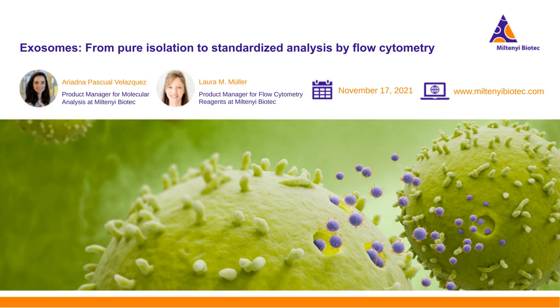What is the size range for the magnetic isolation beads? And the graphic shows them as small compared to EVs. Is this really true with respect to exosomes? I think I already answered this. The size range is 80 to 120 nanometers, so it's similar to the exosome size range. It's a little bit misleading in the pictures shown in the graph. They are more or less as small as the vesicles.